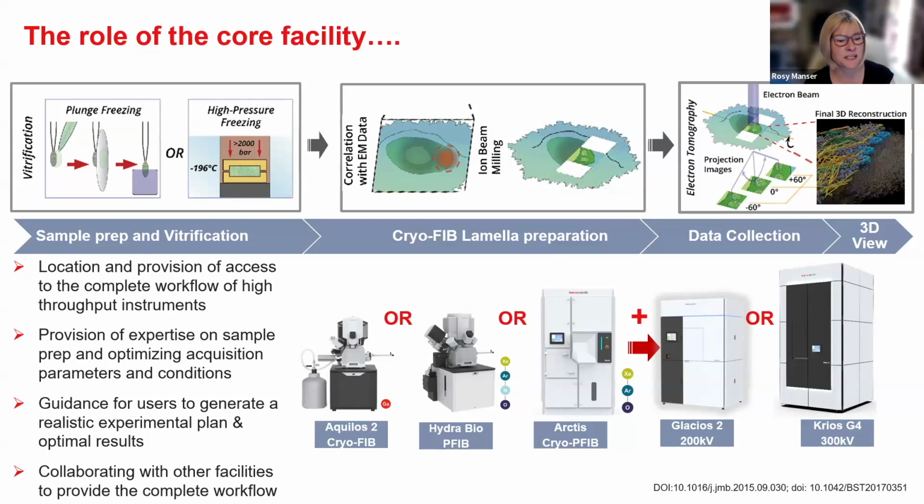And also collaborating with other facilities. This isn't a workflow that needs to necessarily happen all in the same place. There could be people who have sample prep technologies in one place. There might be a FIB system somewhere else, and perhaps a Krios or a Glacios somewhere else. So being able to match together where all of these different pieces of the workflow go is also really important. And I see Euro-BioImaging having a really important role there, to match together users who come back from conferences super inspired with ideas with the facility that can really help direct them to get to these really amazing results.